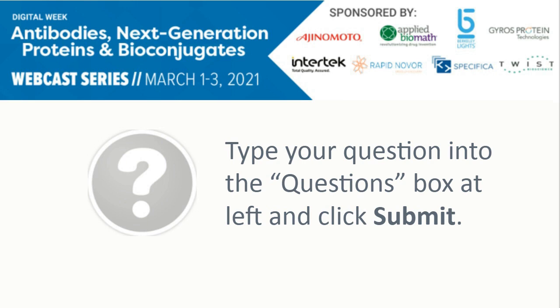Okay, great. Next question. Are you pulling the most high affinity binders from the sample? Yeah, great question. And the answer is yeah, we definitely hope so. Indeed, it is the case that we pull high affinity binders using the antigen-specific column. The antibodies that are going to be left after all that washing are going to be just the best ones in terms of their binding affinity. So indeed, yeah, we're pulling high affinity binders out of our purification scheme.